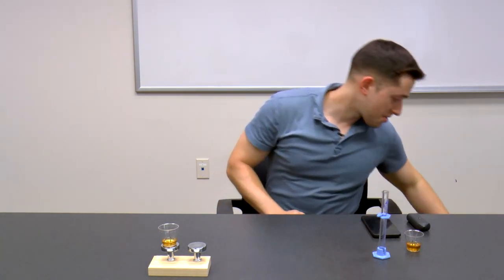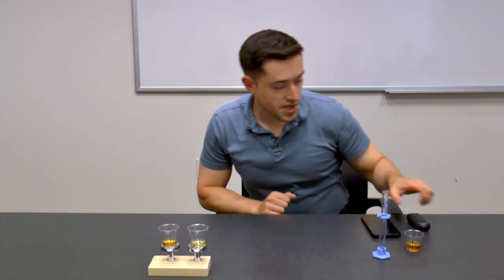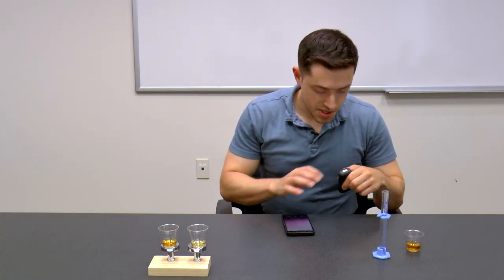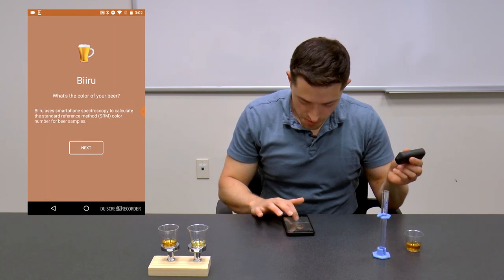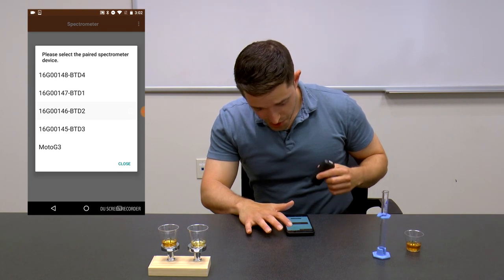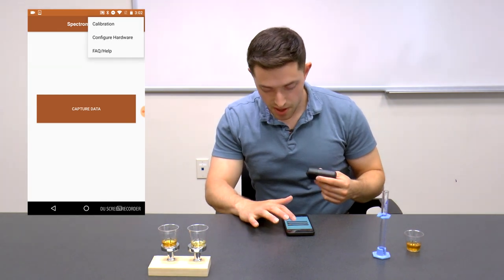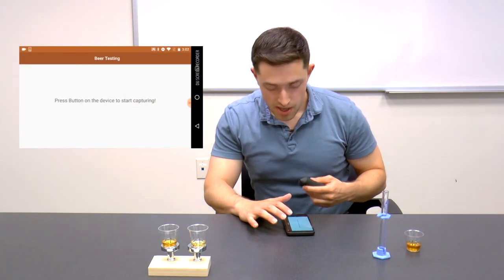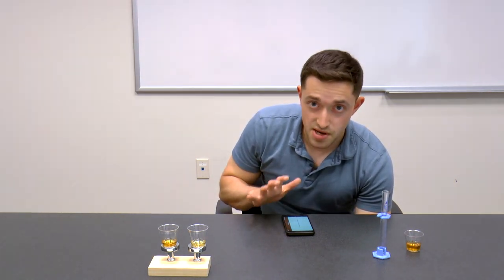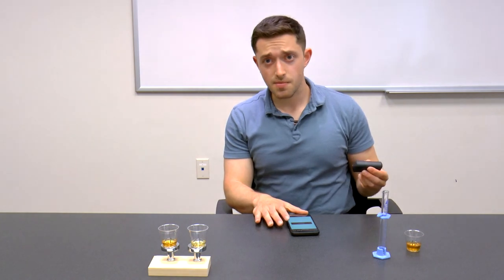Also with me today, I have a lighter beer sample prepared as well. Now we are ready to begin. I'll turn on my spectrometer module and bring up the app, connecting through Bluetooth. First, I need to calibrate for a dark reading to make sure we are measuring the proper signal. To do that, I'll initiate it on the app, cover the aperture, and put it under the table to make sure absolutely no light is hitting the spectrometer. After that, I can save it and we are ready to begin.